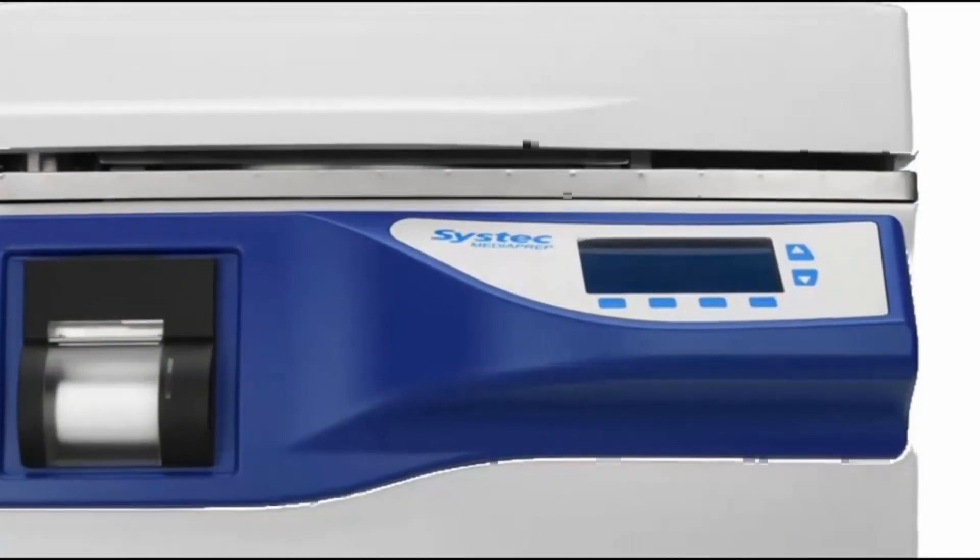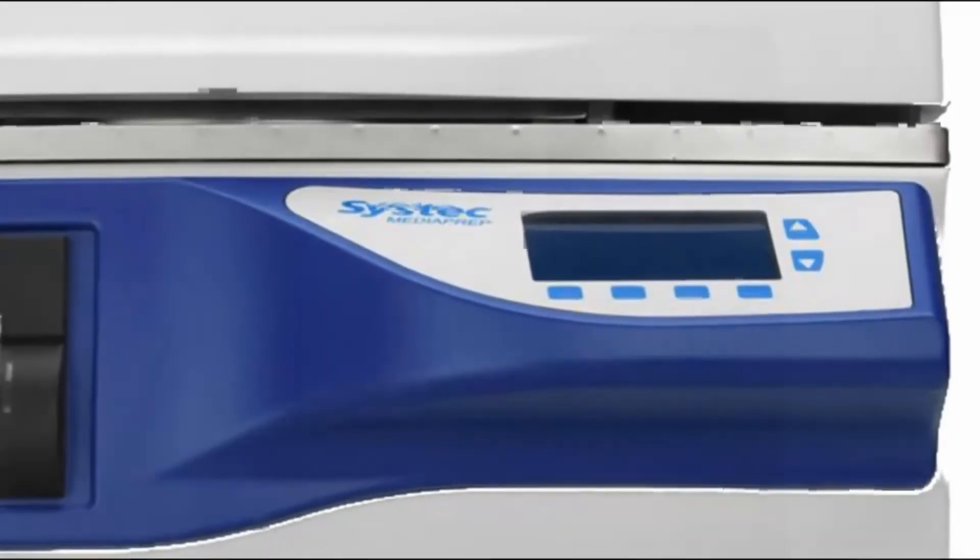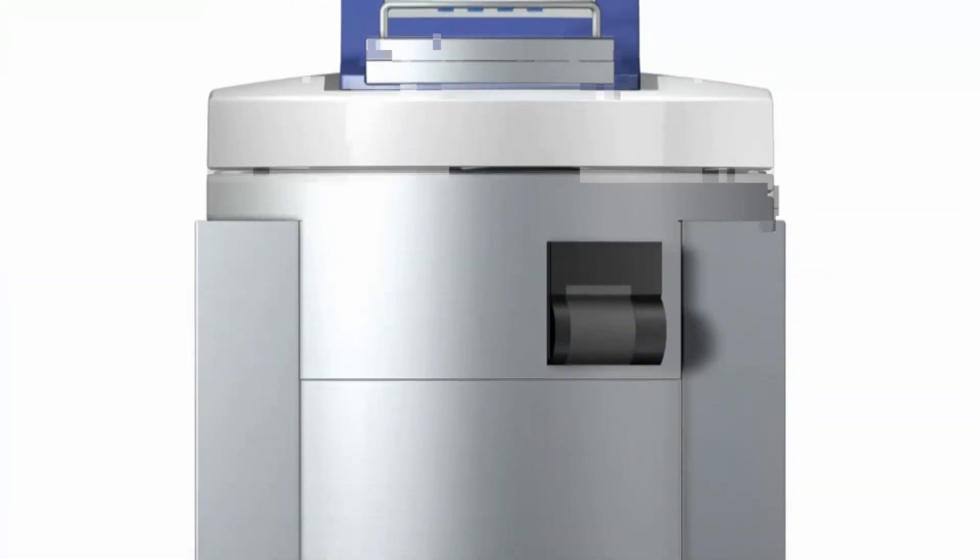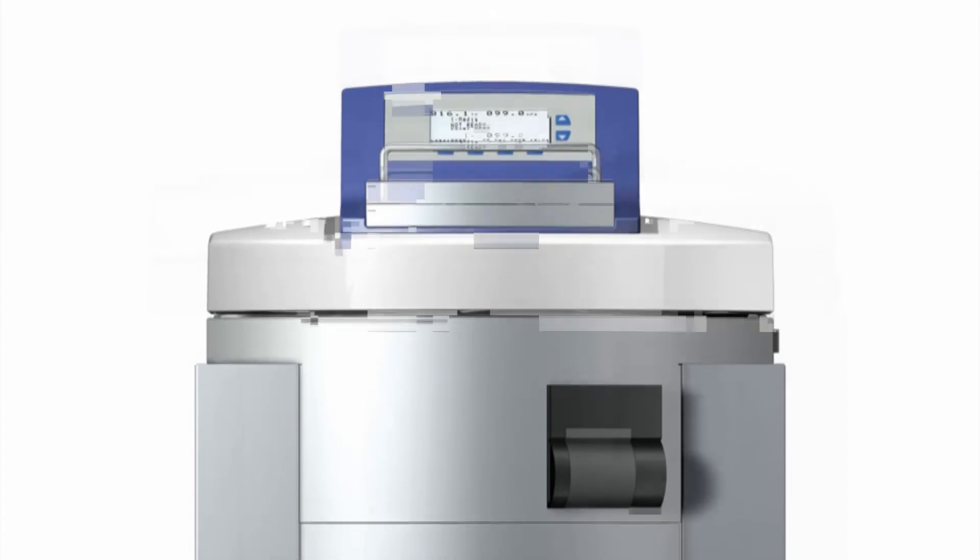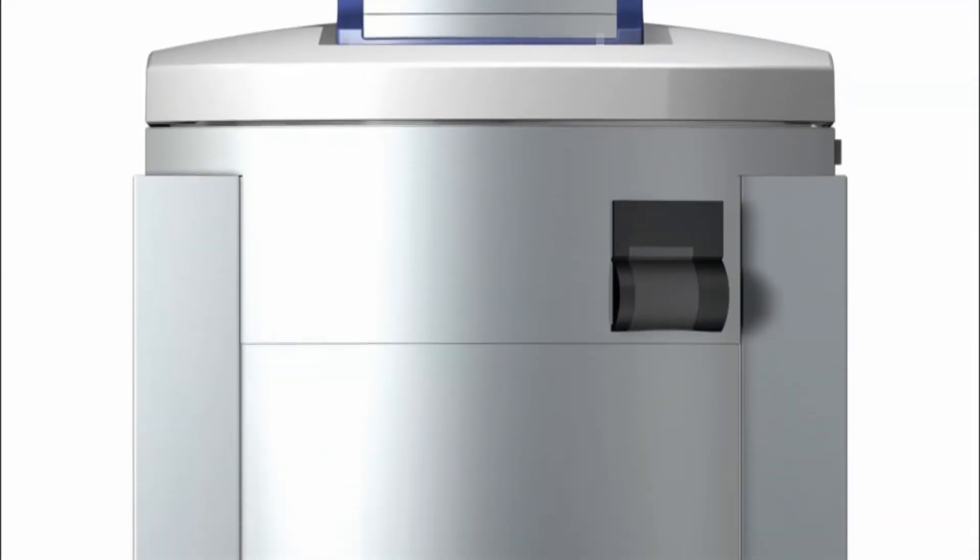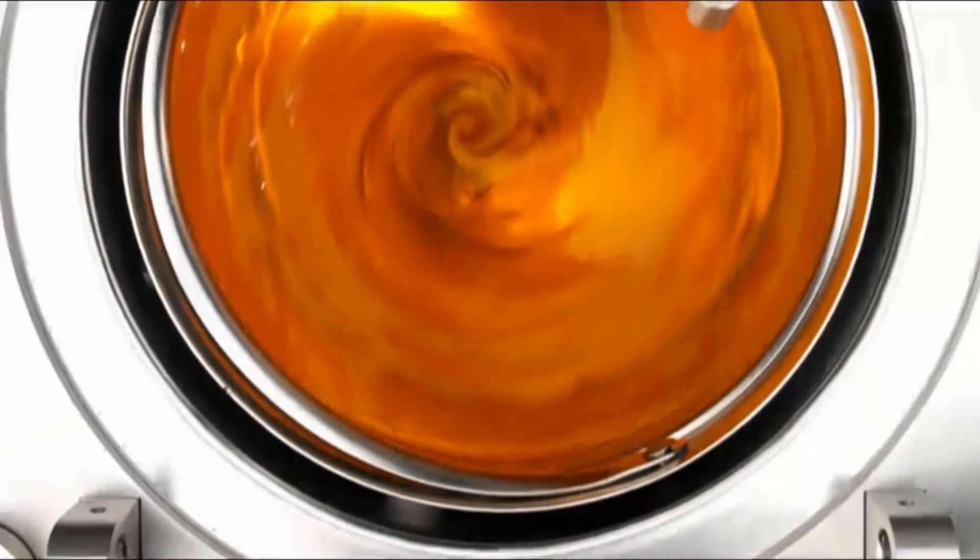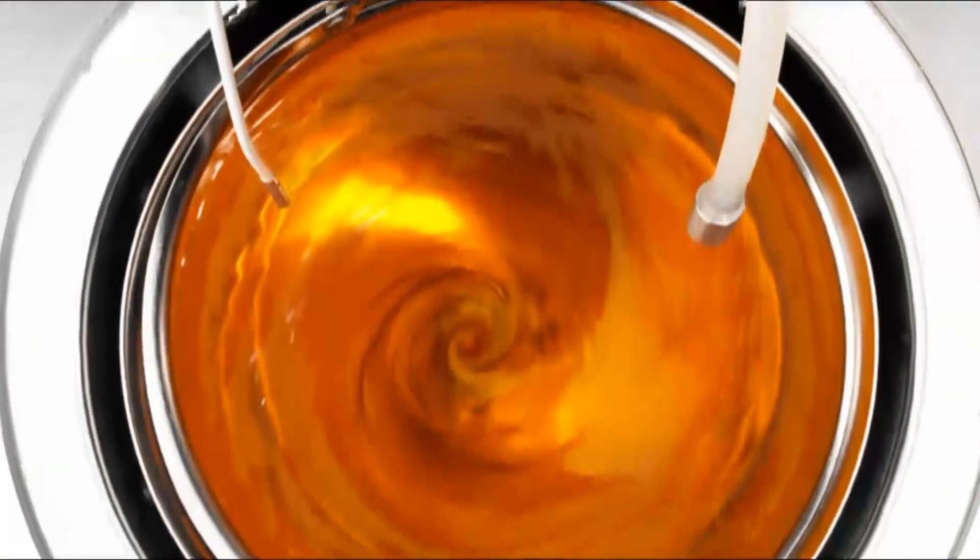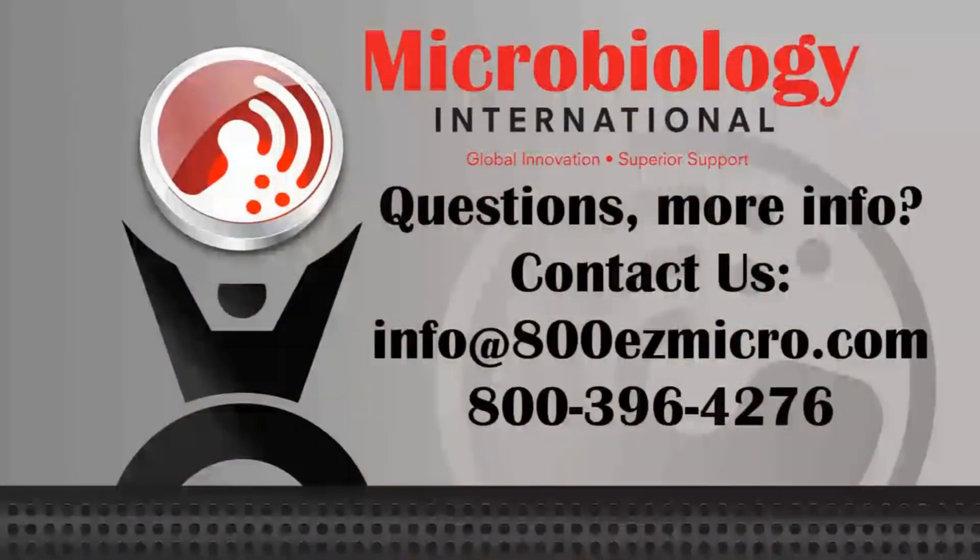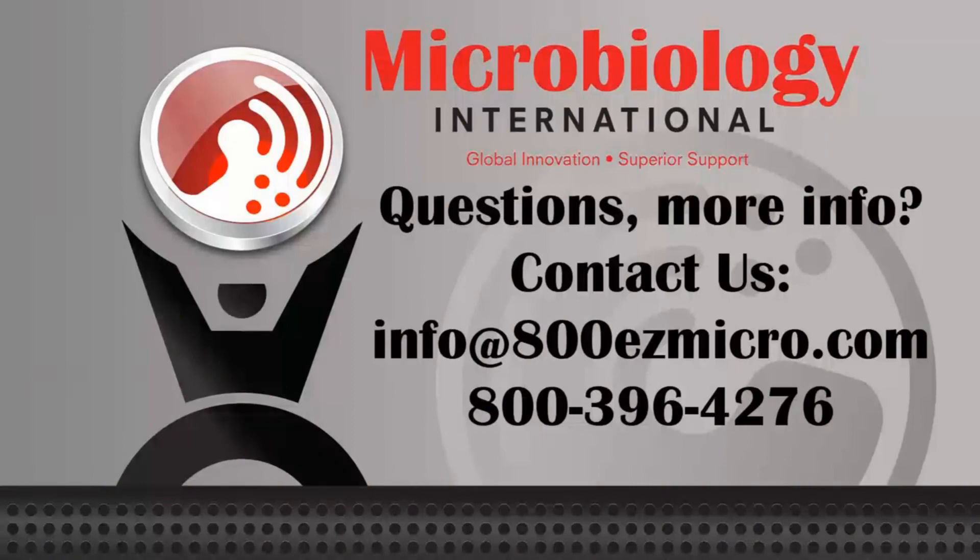SysTec MediaPreps offer fully automated media preparation and sterilization with accurate process controls, ensuring reliable results. All SysTec MediaPreps are delivered with full NIST traceable calibration. Please contact Microbiology International to see how SysTec MediaPreps can streamline your media-making operation.